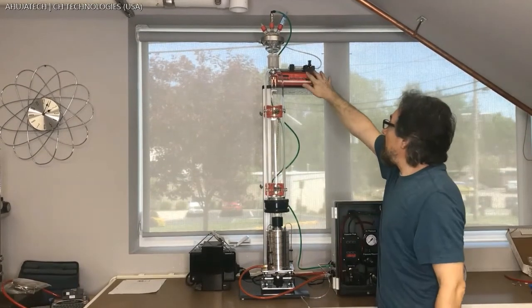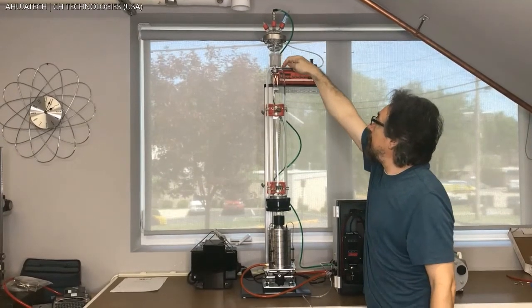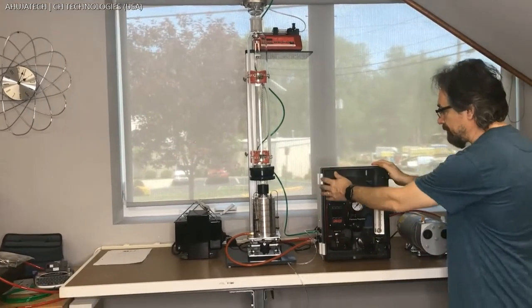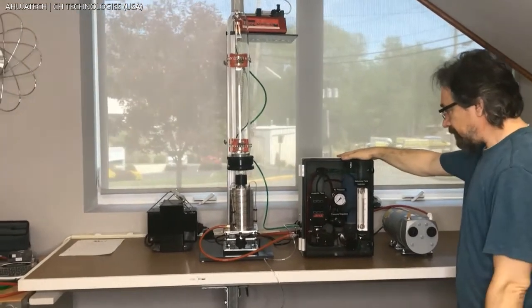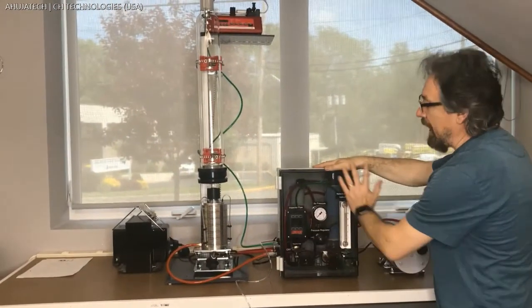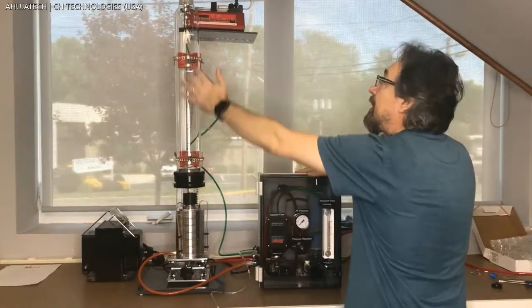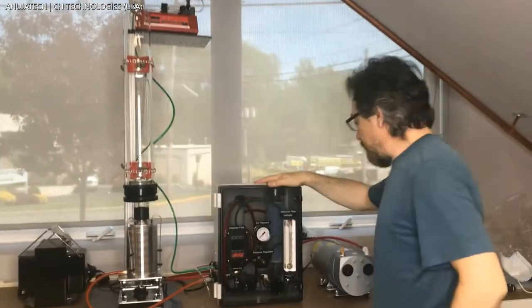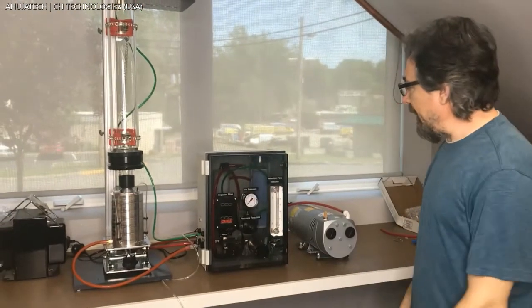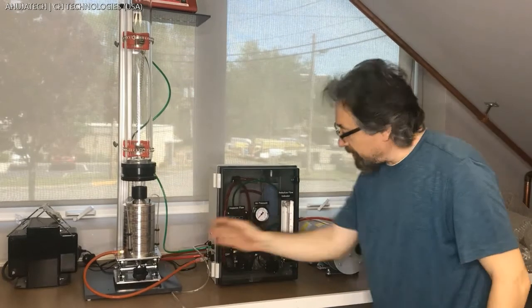On top of the column we have the syringe pump that will pump the liquid into the nozzle. To the right we have the control unit that includes all the air pressure controls and the flow controls for both the impactor sampling as well as the aerosol generation. Inside the box there is a filtration system for the system exhaust.